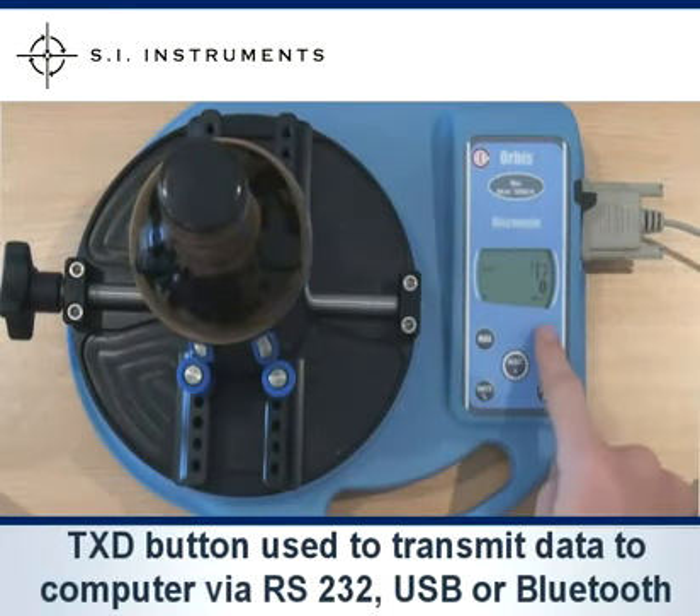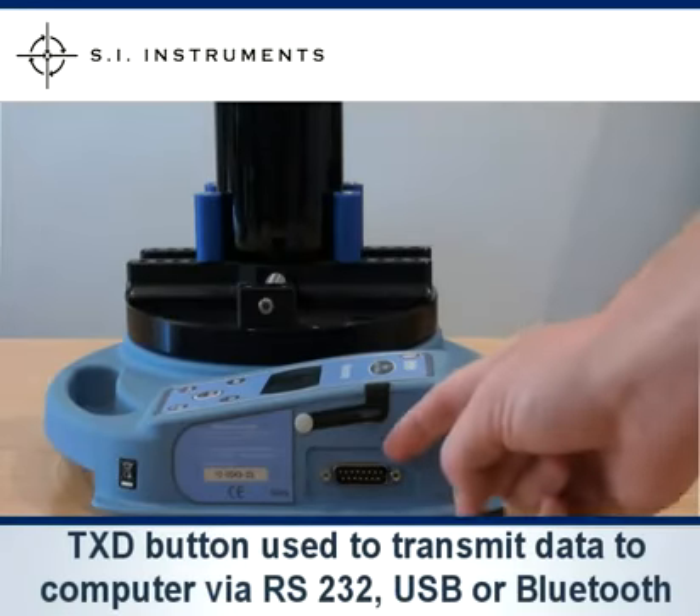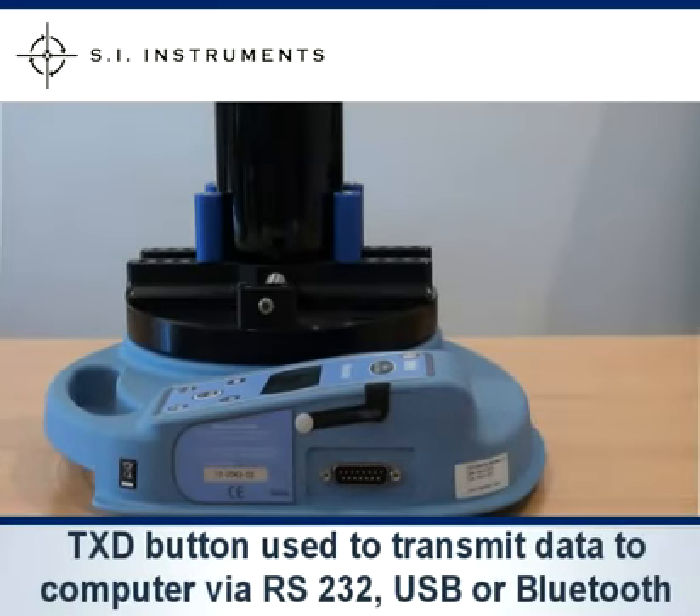Pressing the TXD button on the MacMesson Orbis transmits the data via RS232, USB or wireless Bluetooth to the PC for further analysis.